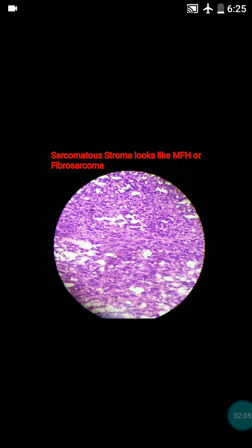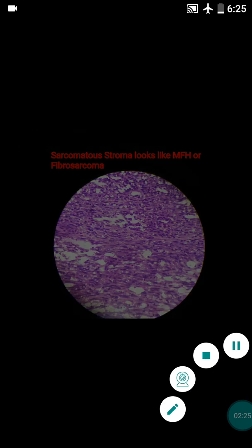It can mimic MFH or fibrosarcoma, which come under the differential diagnosis. In the malignant phyllodes tumor, the sarcomatous stroma can resemble fibrosarcoma, MFH, liposarcoma, or osteosarcoma, but it is in fact a variant of malignant phyllodes tumor.